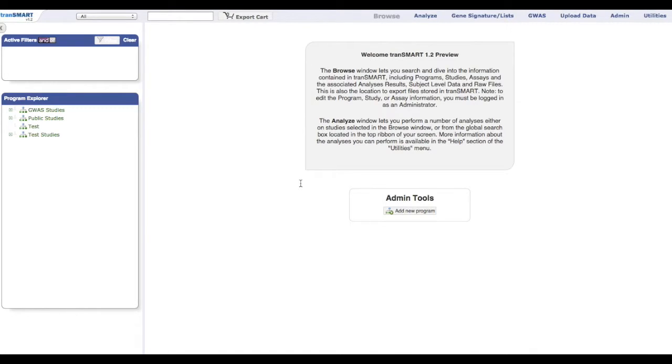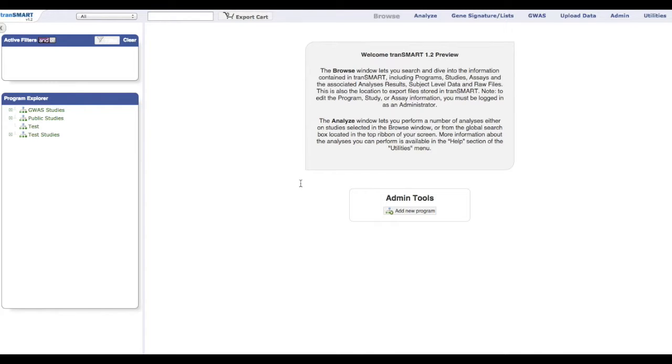In this tutorial, we will be demonstrating the Dalliance Genome Browser within Transmart. The browser was developed to visualize genomic data, compare genomic variants between different patient cohorts, compare different types of genomic information, and compare with public genomic information such as cosmic variations.